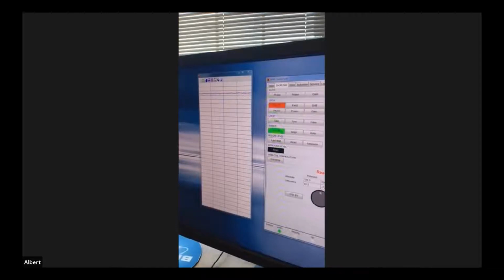But you can see right here that it's going through its parameters, and it's gonna set the lock at a certain parameter, and then it'll be done. So now it says lock done. Then the next step is to tune the probe. It's an auto tune, not like Auto-Tune. So if I just click tune, you're gonna see it tune the probe to the sample.